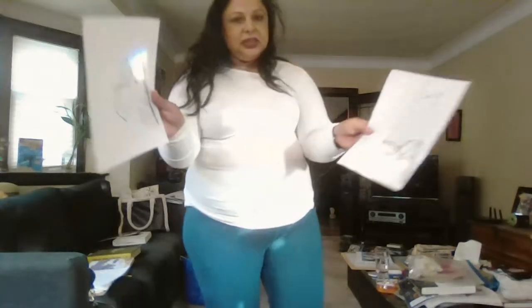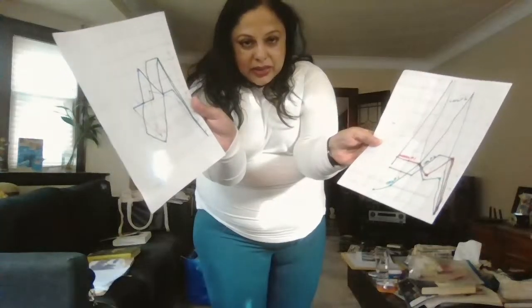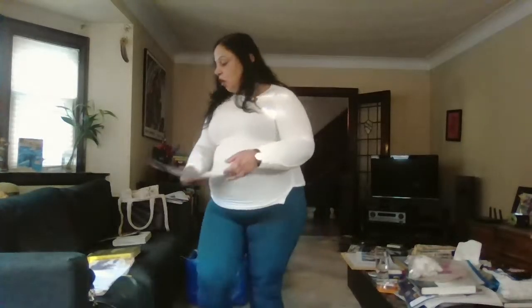But the peaks are the same. So the dark ink, the ink blue, there are two peaks here as well, but it's just higher with the addition of pressure. It's an interesting system to study, isn't it? With what I have, there's only so much I can do.